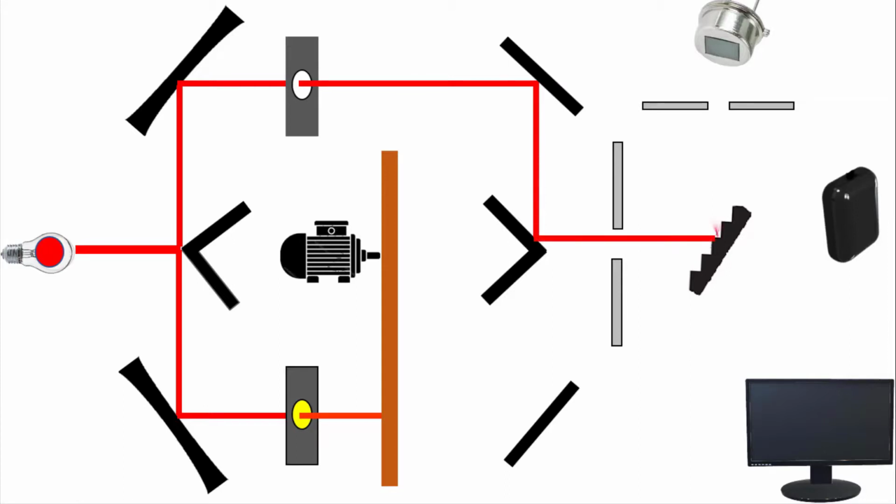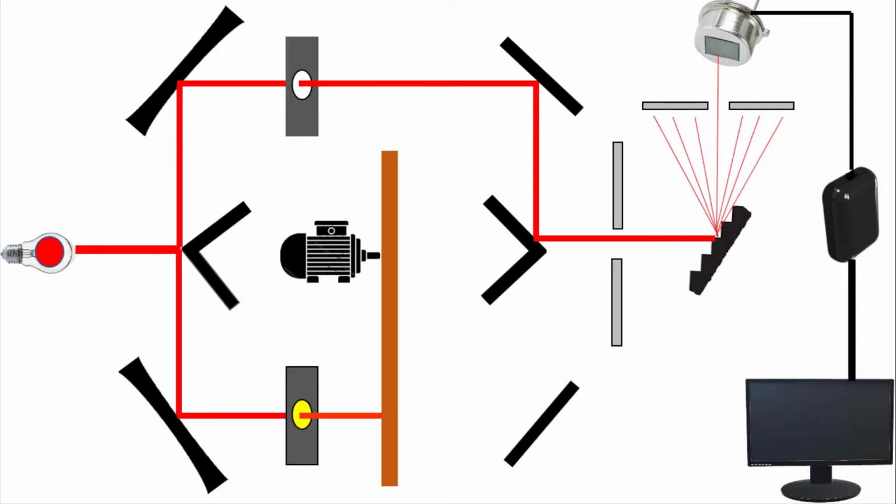That radiation passes through the mirror and is directed to the slit, then the gratings, where it disperses, and from 4000 to 400 centimeter inverse it passes to the detector, then to the amplifier and then to the recorder. So this is one path. Now the second time, the chopper cuts off the path of the reference cell and opens the path from the sample cell.